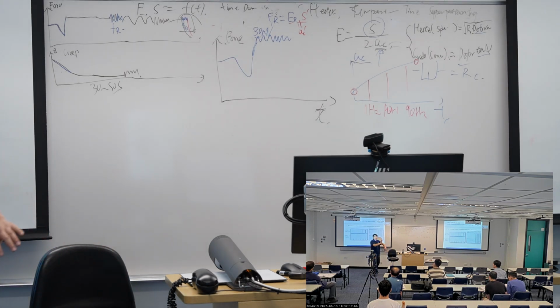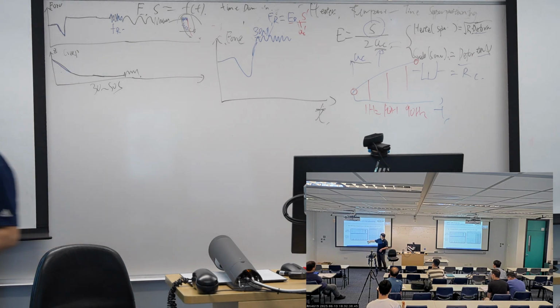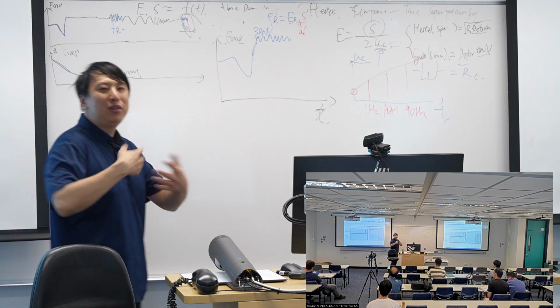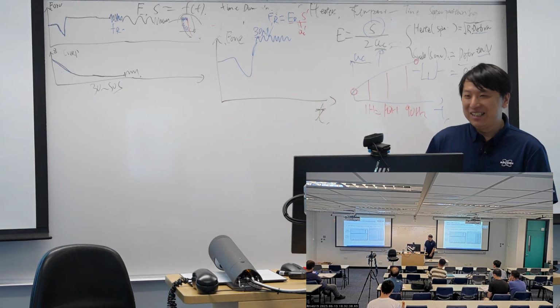Yeah, that's our daily experience. So usually we should be able to observe the modulus increasing against the frequencies. But if you find it decreasing, maybe you did it wrong, maybe you did some weird things. So yeah, that's the idea.